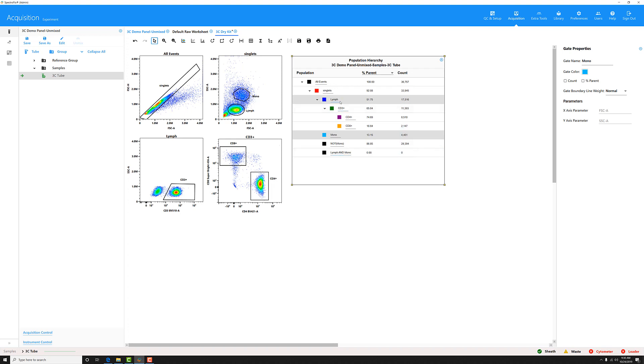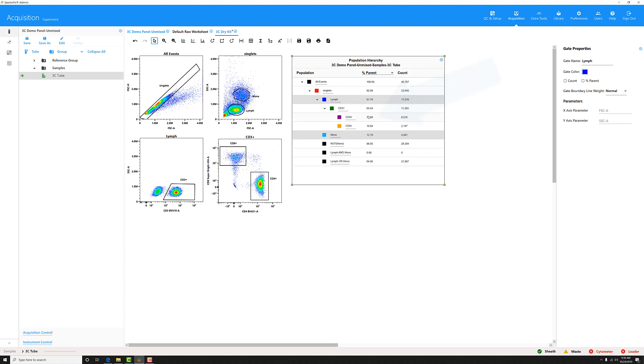I can do the same thing for the OR gate. I select the populations that I want to apply the OR gate to, right click and select the join OR gates. And you can see that gate has appeared in my population hierarchy as well.